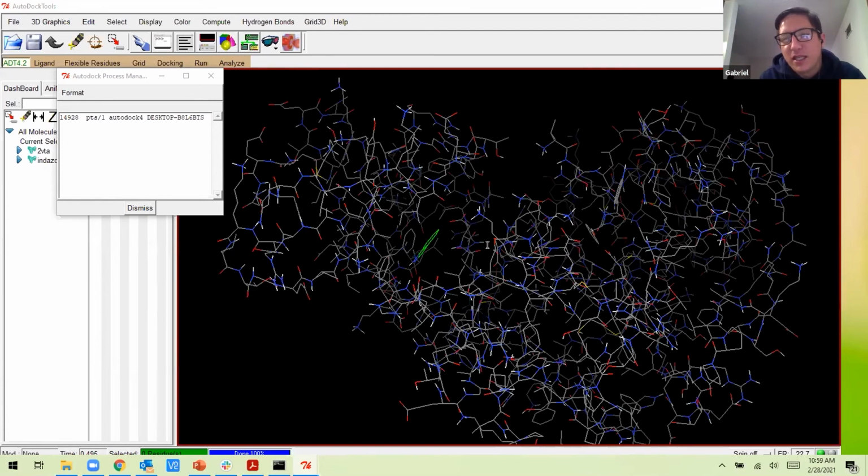That's the power of coding, right? You can just write your script, change the protein, change some things, and do it all over again. But this is more visual, so if you feel comfortable programming, that's fine. It's running, it's almost there.